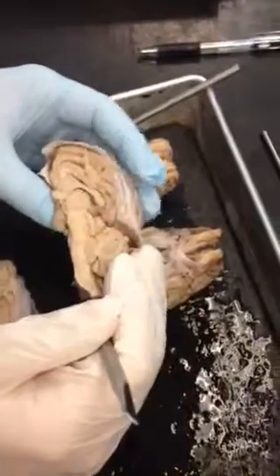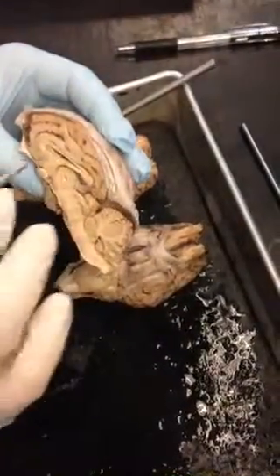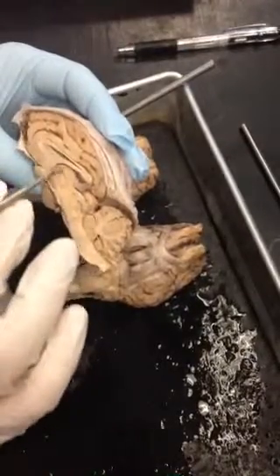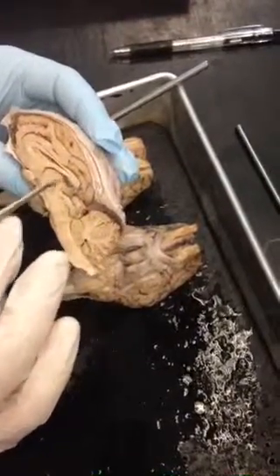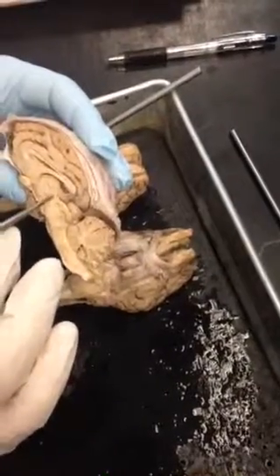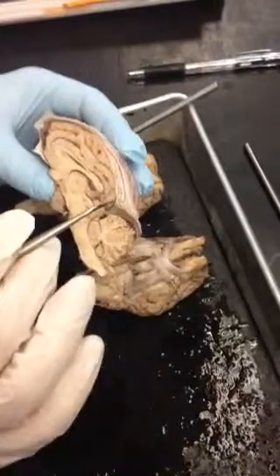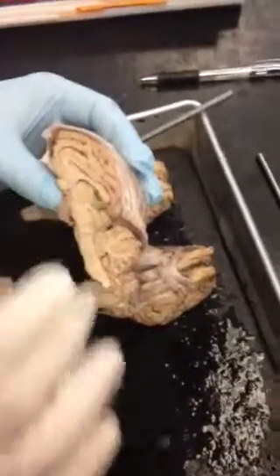The third ventricle, septum pellucidum. So from the lateral ventricle, the CSF goes to where? The third ventricle, through the interventricular foramen. Then from the third to the fourth ventricle, it's the cerebral aqueduct.